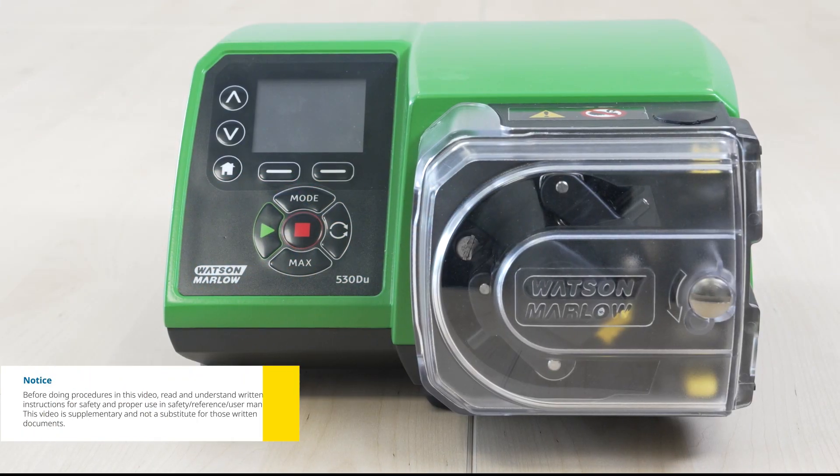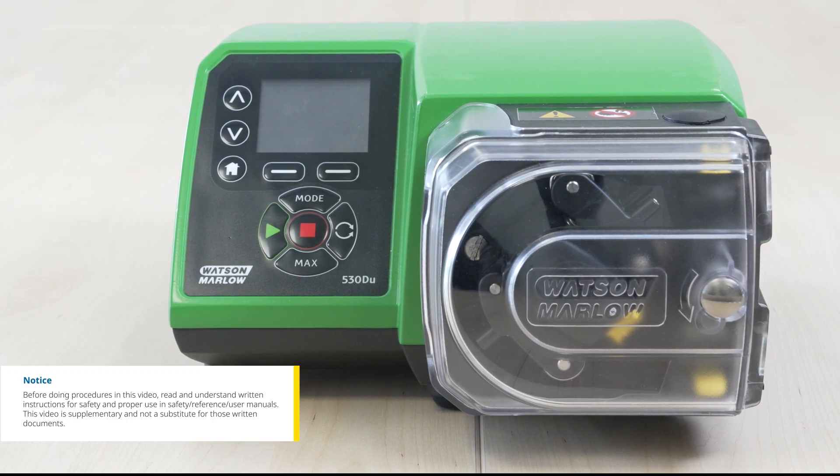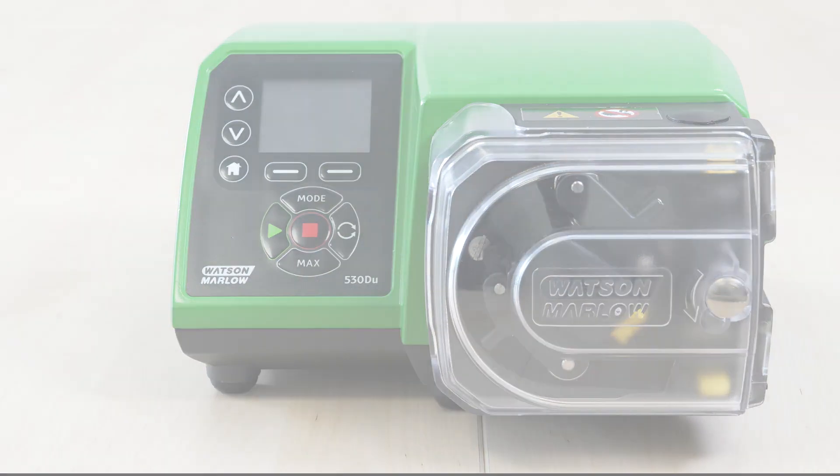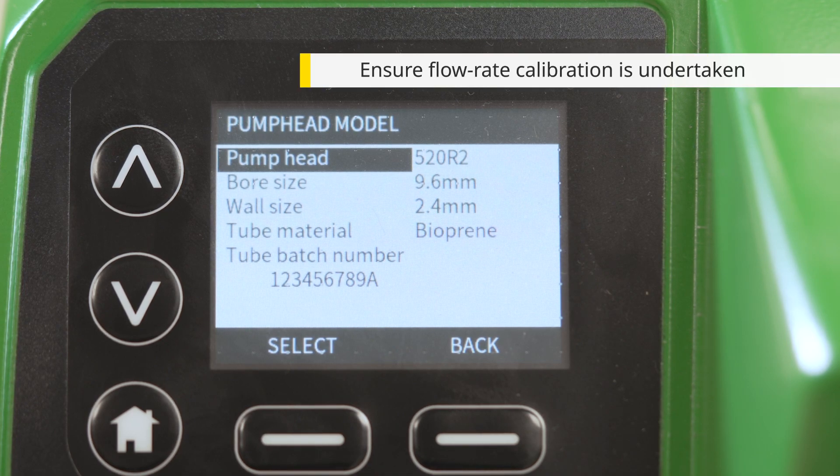In this video we will show you how to set up and run the Watson Marlow 530 peristaltic pump in Memodose mode. While setting up Memodose, make sure the pump head and tubing options have been selected in the general settings and flow calibration has been performed.